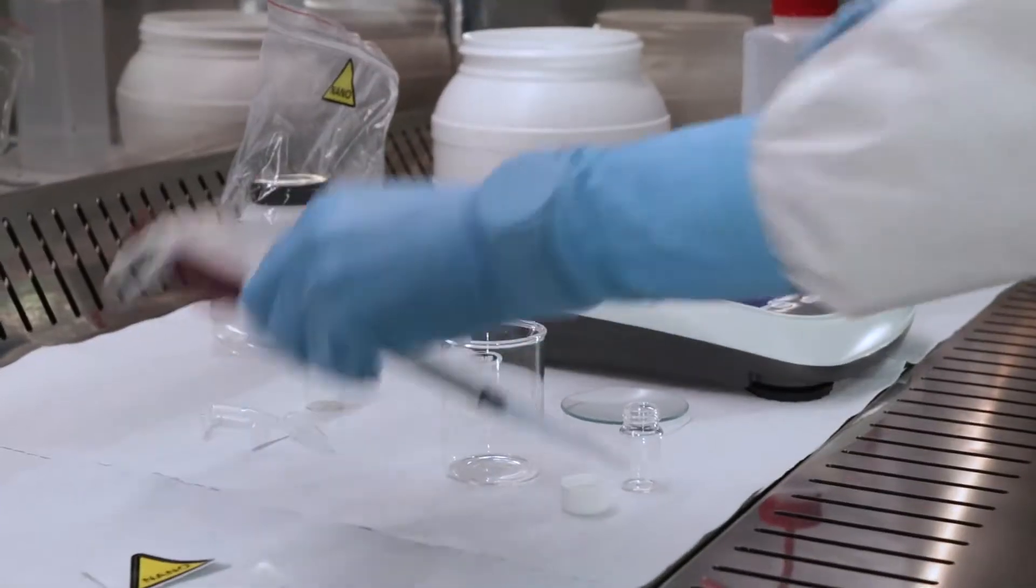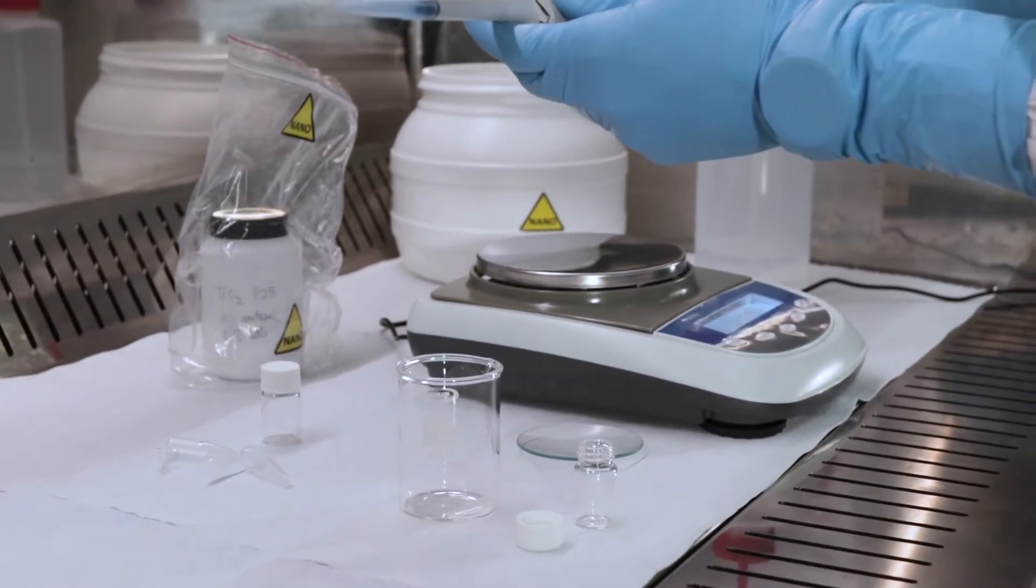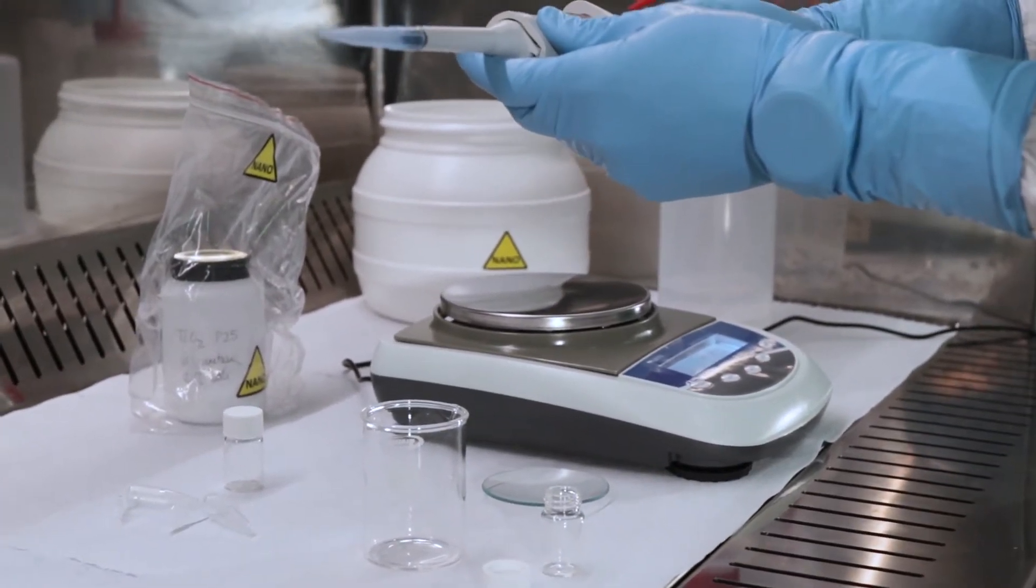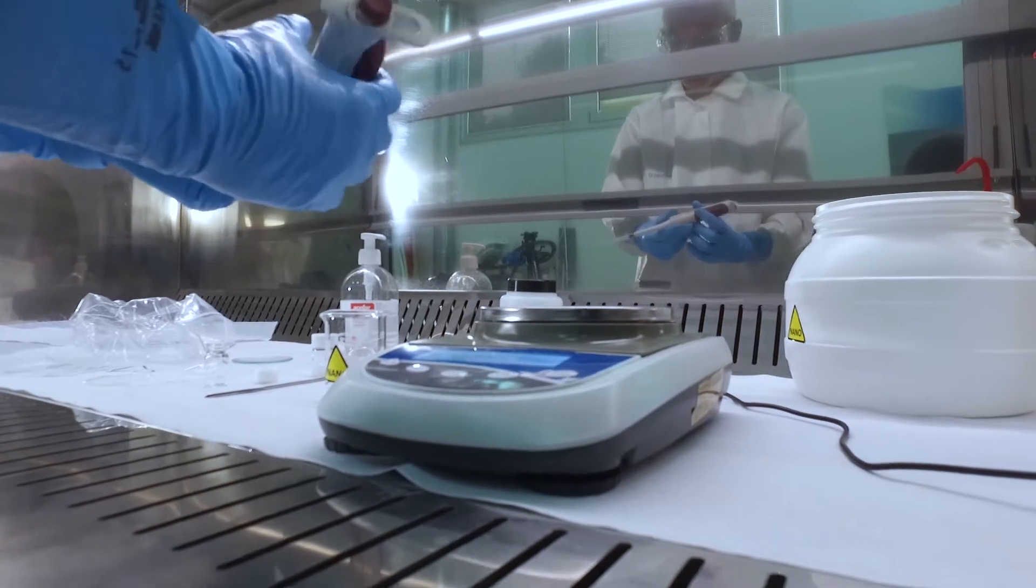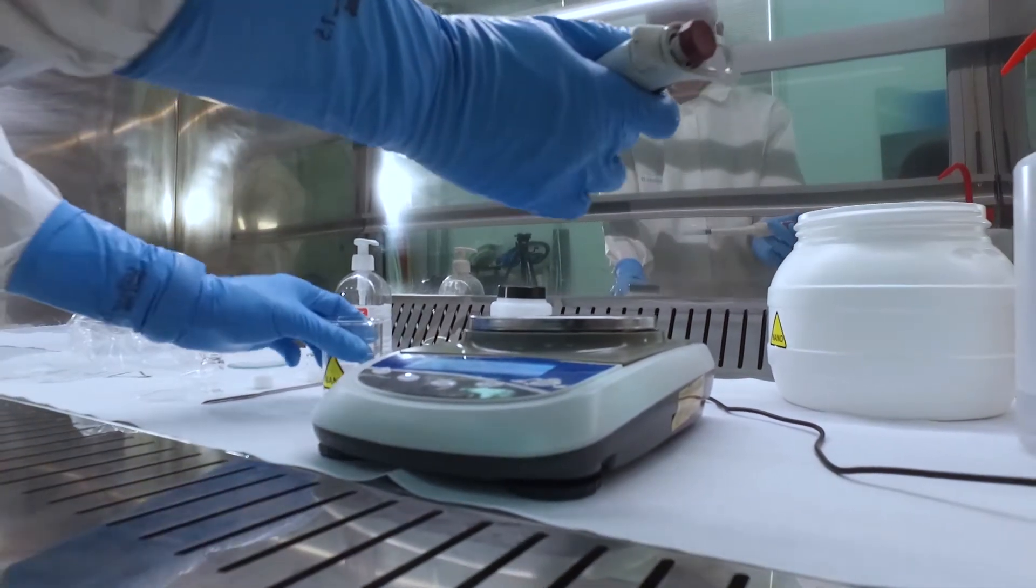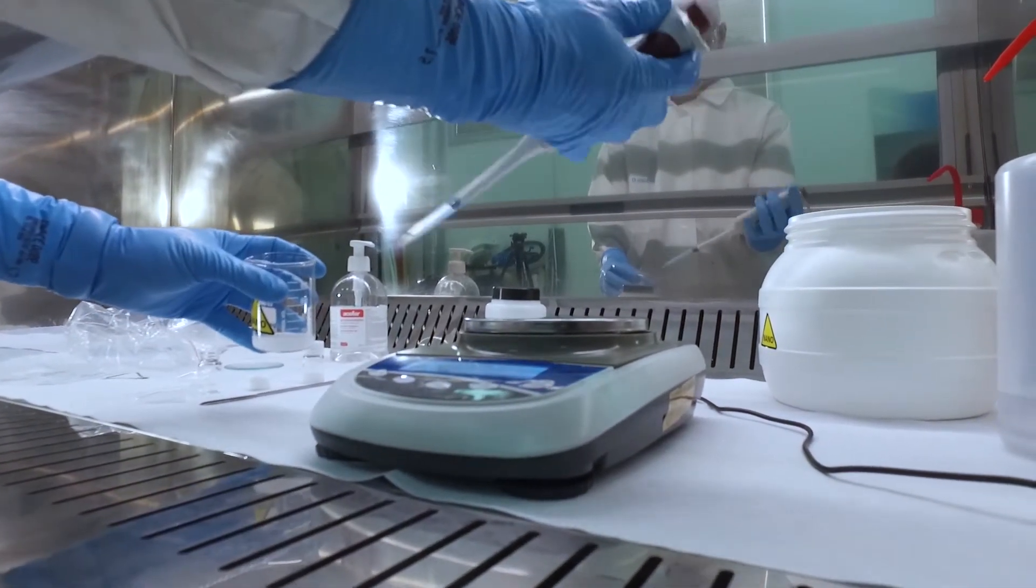Other collective protective equipment with variable air volume are characterized by maintaining a constant air velocity in the sash plane. So far, these are the ones that have shown a lower release of nanomaterials outside.